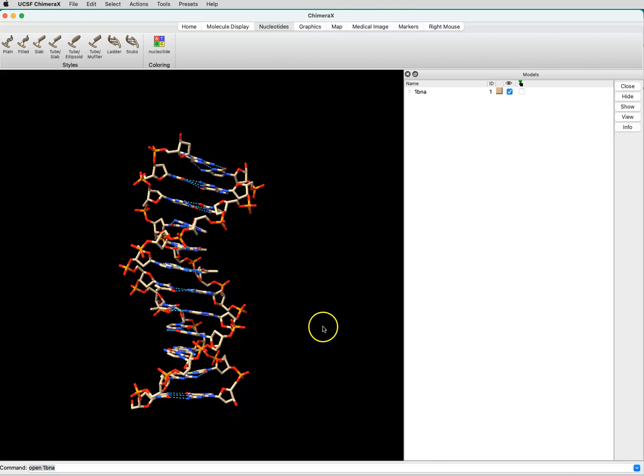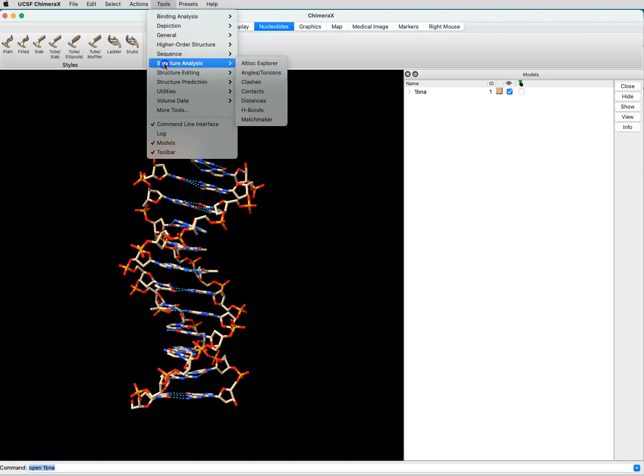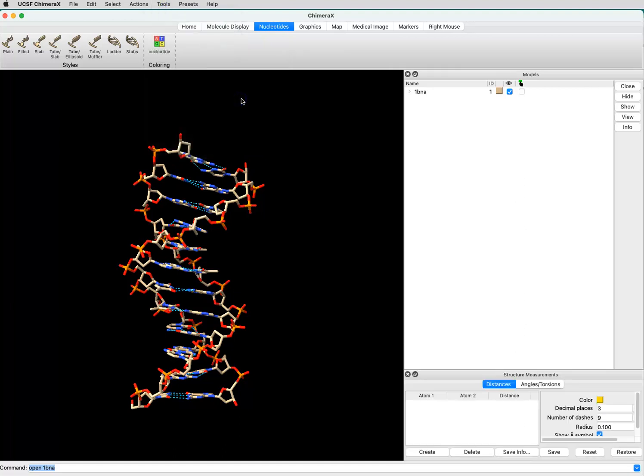Now to measure a distance, we can go up to the Tools menu, and select Structure Analysis, and select Distances. In the bottom right of our screen, the Structure Measurements box will pop up.